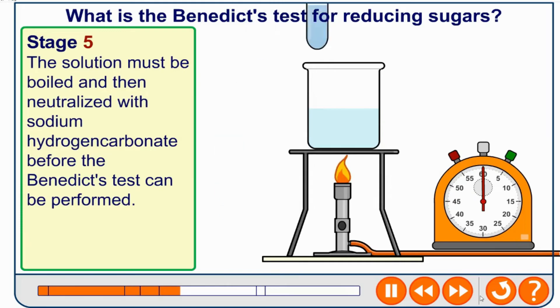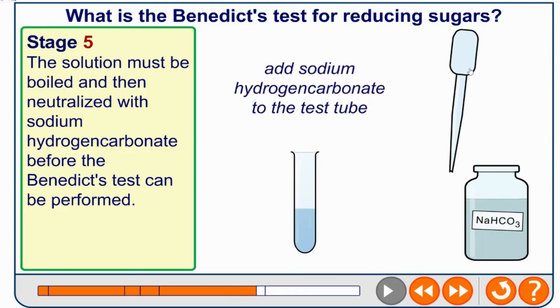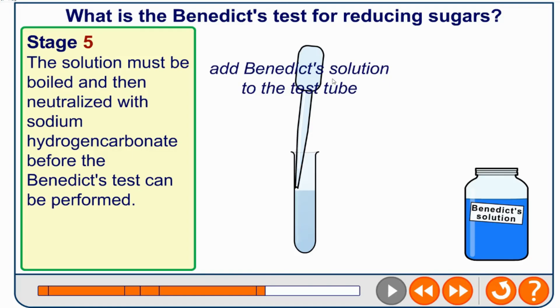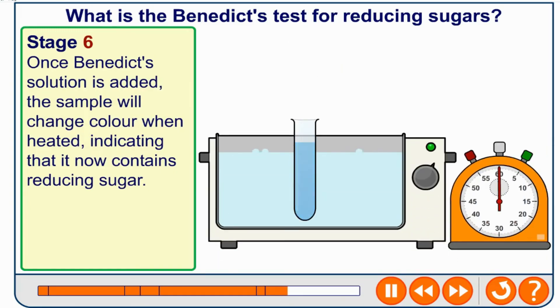Stage five: it's boiled first, and then after boiling we neutralise the acid with sodium hydrogen carbonate, as the Benedict's test won't work unless it's at a neutral pH. So we add sodium hydrogen carbonate and then add some Benedict's. Once added, the sample is put back into the water bath at 85 degrees Celsius.